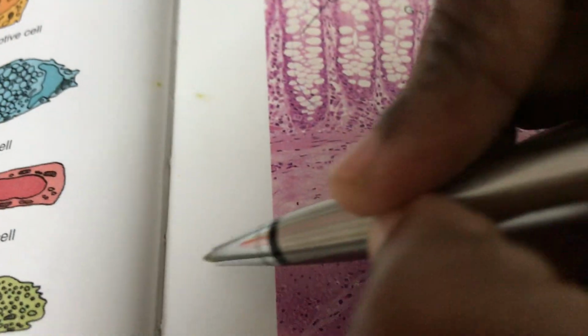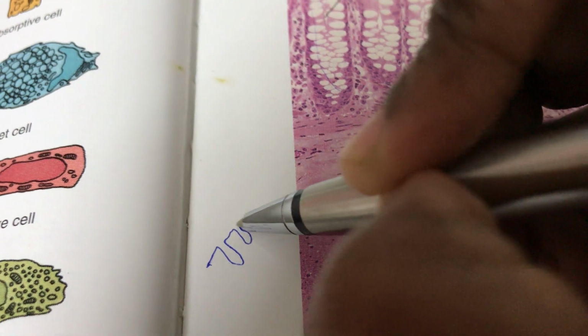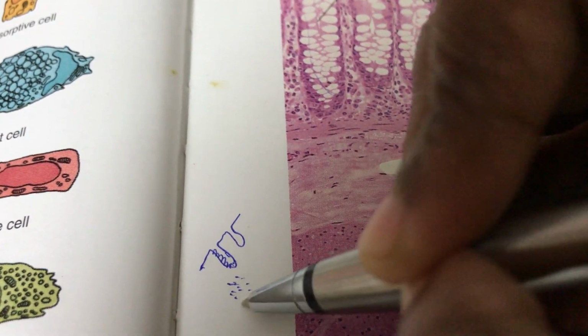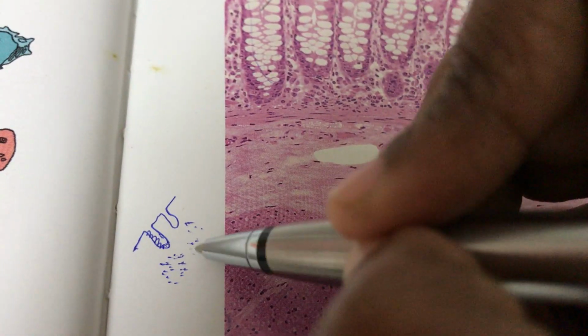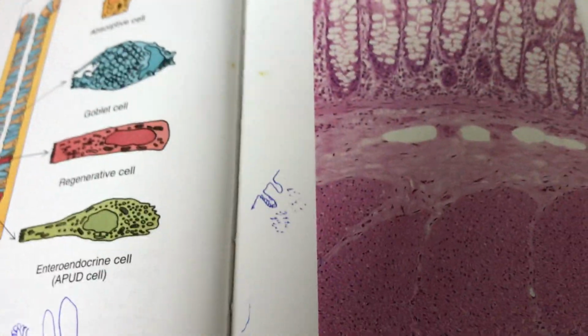be having the lumen, a small lumen, and you will be having the smaller crypts lined by columnar and the goblet cells. And here also you will be having a lot of lymph nodules. That is the most important feature. Here you have just lymphocyte aggregation only, but here lymph nodules will be seen in the appendix. That's the most important feature of the appendix.